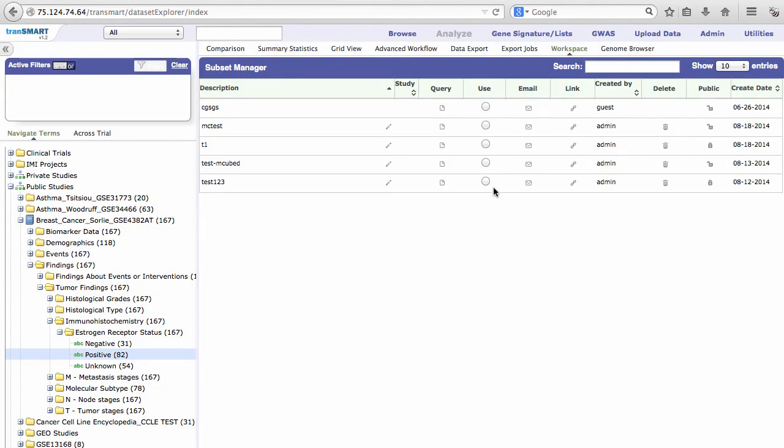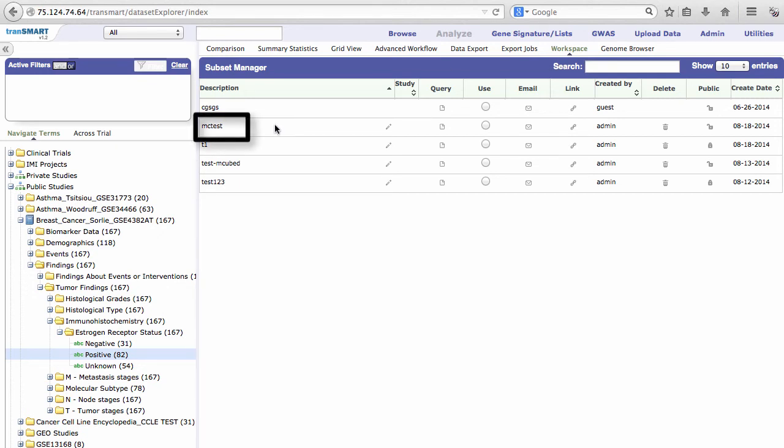You are now directed to the Workspace tab. Here we can see that our subset was successfully saved. Here is MC Test in the list.